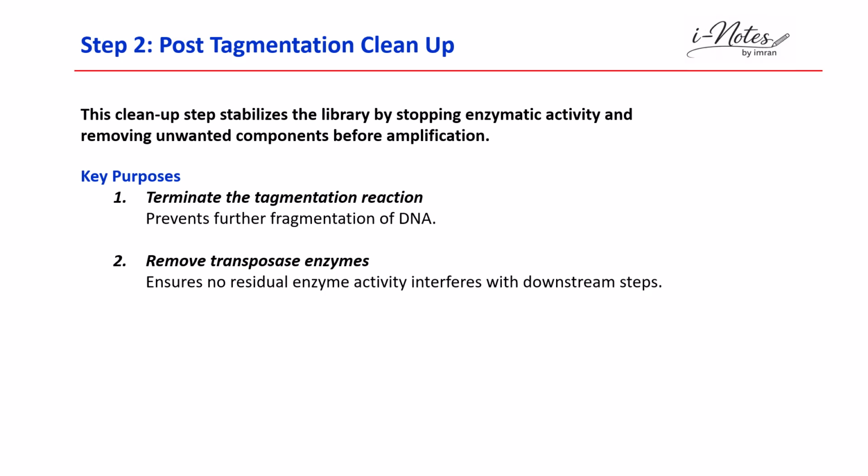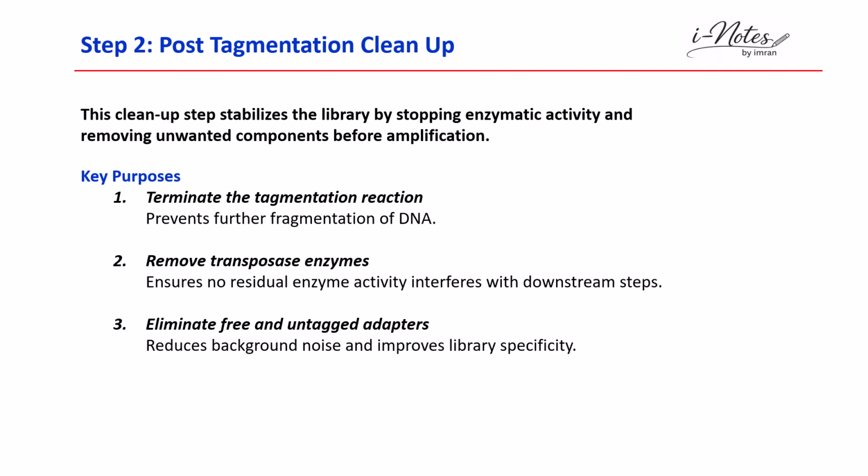That washing removes the residual enzymes like transposase and also the salts, making the fragments clean.